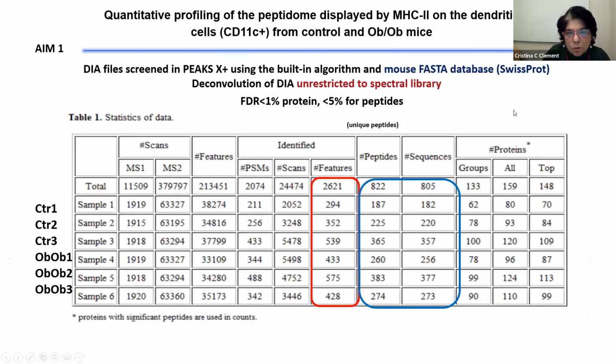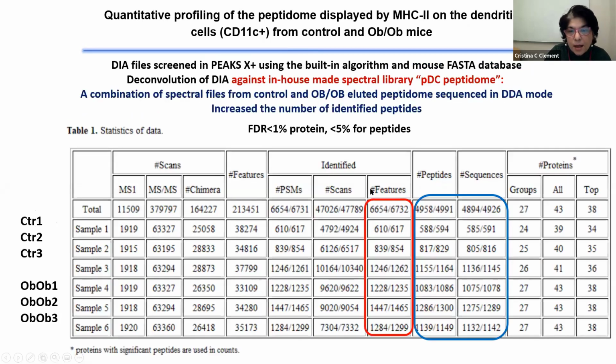And as Dr. Paul mentioned earlier, we are using both DDA and DIA just in the immunopeptidome. I'm just showing here how the DIA data were deconvoluted by a search here, spectral library independent. And in the next slide, you can see here spectral library independent analysis combined with the database search, de novo search, and then spectral library dependent improved the amount of sequences, the identification of the immunopeptidome.